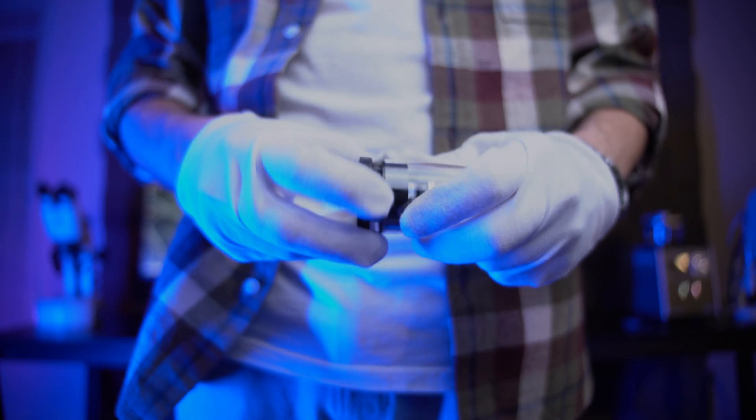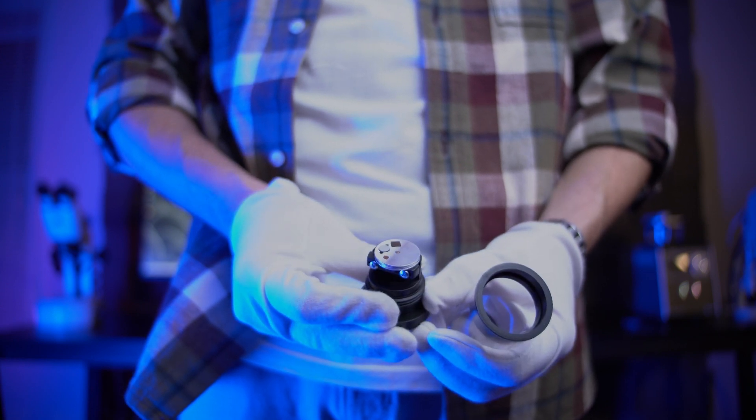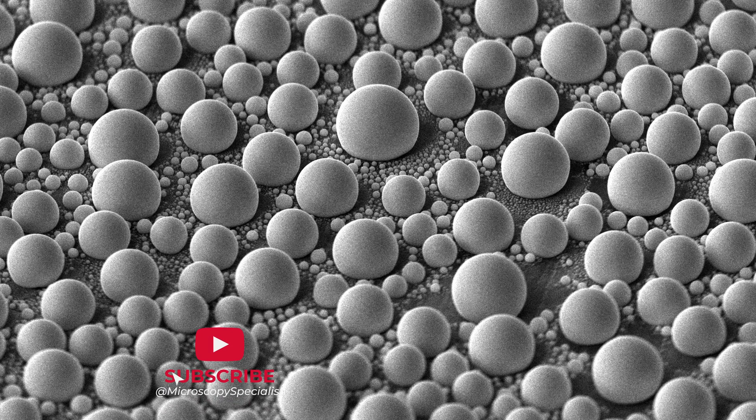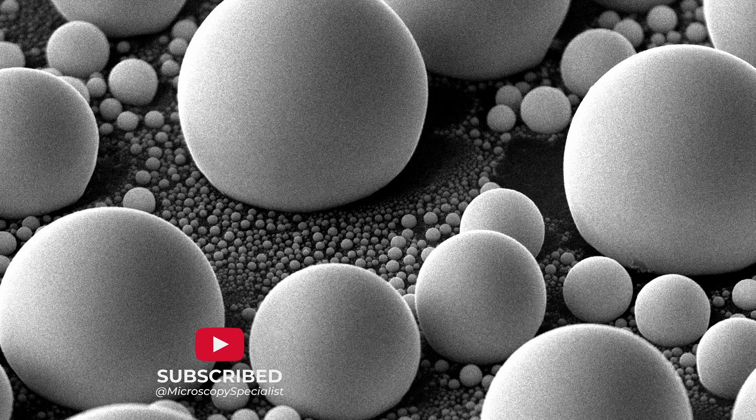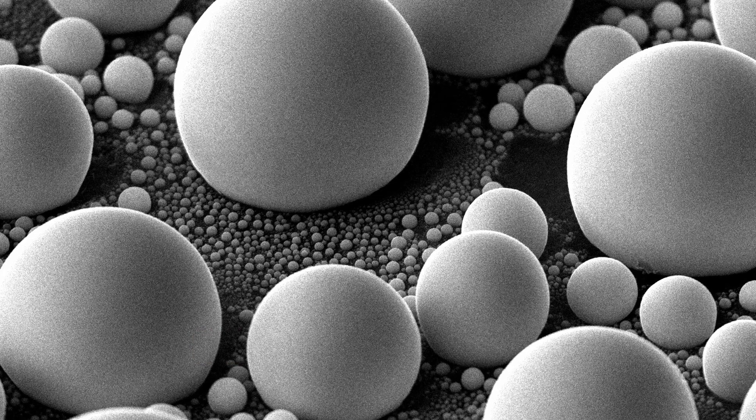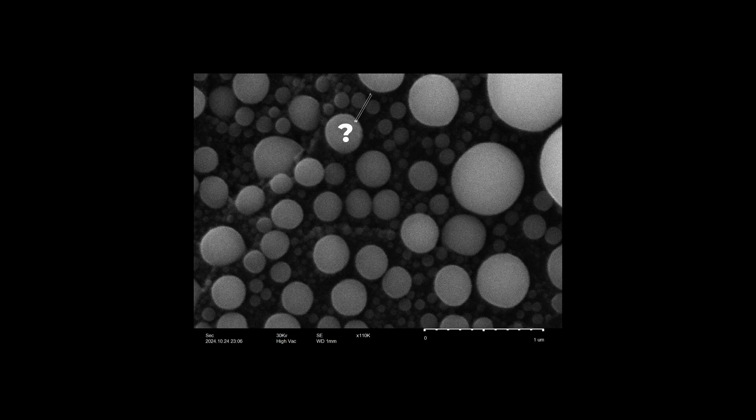Today we will be working with a special sample resolution standard – tin on carbon. It looks like tin spheres of different diameters. This sample is ideal for setting up and demonstrating the microscope. We can also understand the true resolution of our microscope by measuring the minimum visible gap between the spheres.